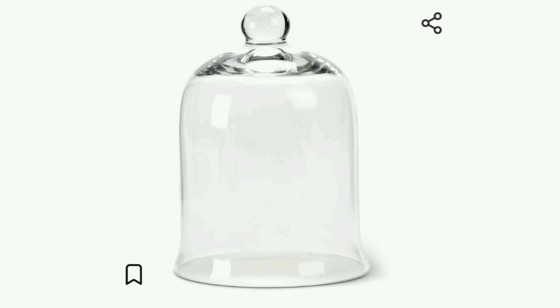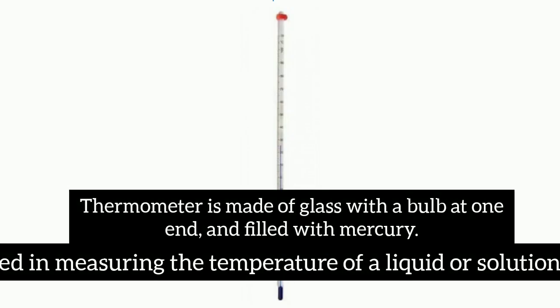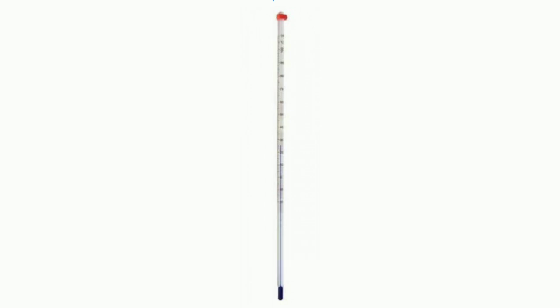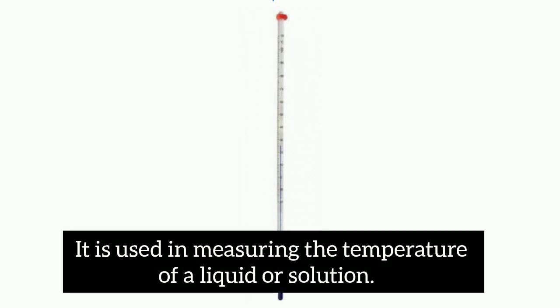Lastly, let's look at thermometer. Thermometer is made up of glass with a bulb at one end and filled with mercury. We use it in measuring the temperature of a liquid or a solution in the lab.